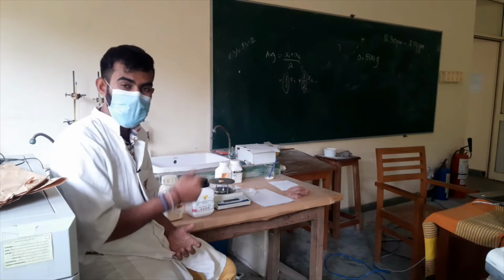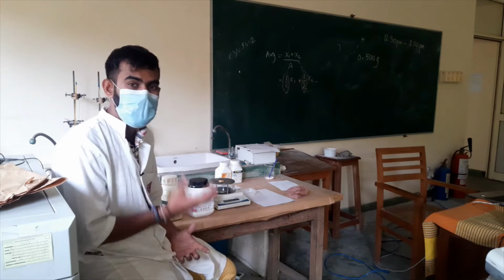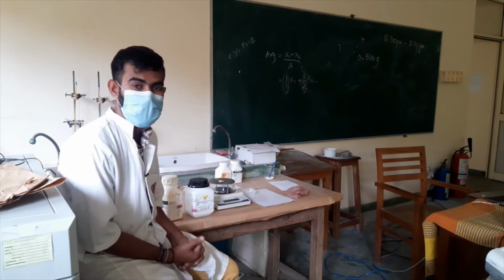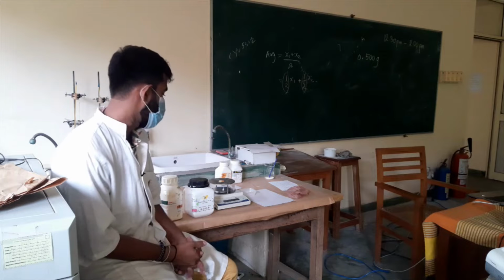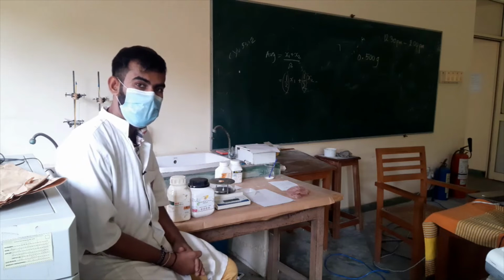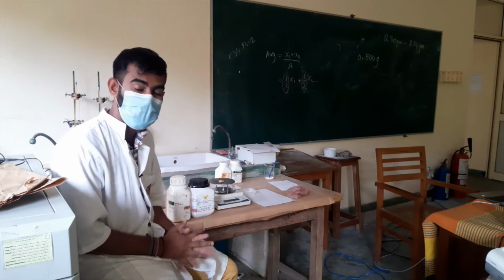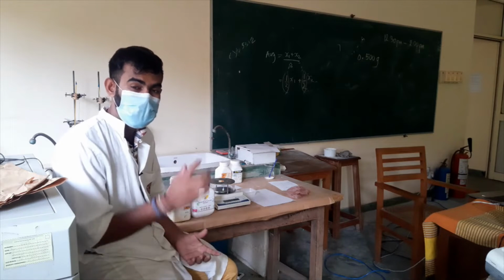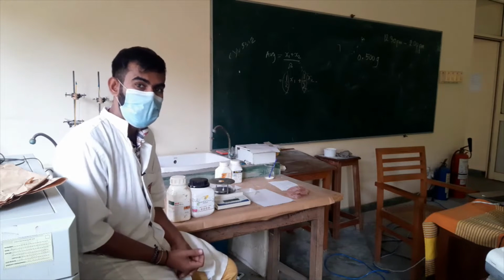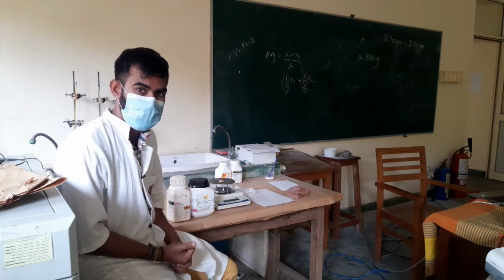water, and we have to mix it very well, and we can use that paste to stick our silica gel on our glass sheets, or glass plates. Here I will measure 20 grams of each silica gel, mix it properly within a conical flask, and after that I will add 80 milliliters of water and make the paste of silica gel. So come and closely look at what I am doing here.